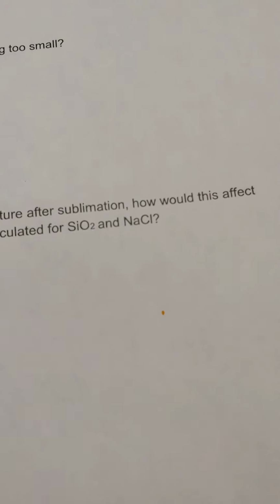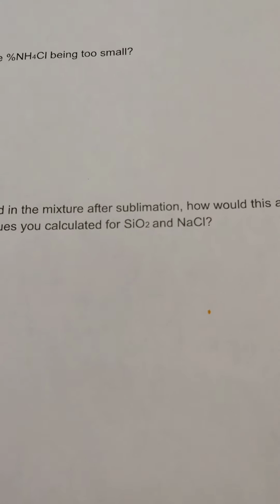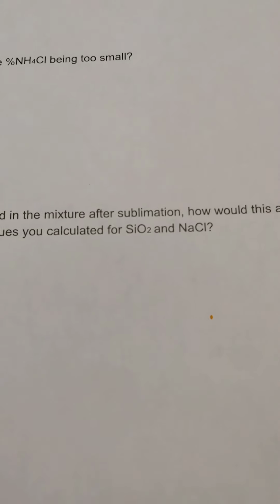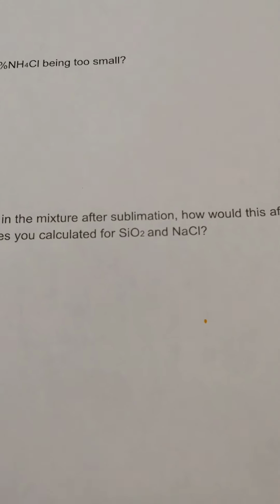The one thing I will tell you in relation to that question is that ammonium chloride also dissolves in water. So think about what's going to happen to it if some of it remains in the dish, and we know that it also dissolves in water.